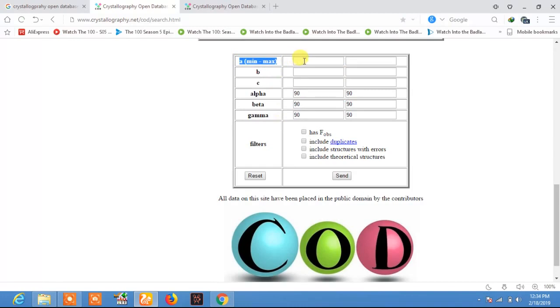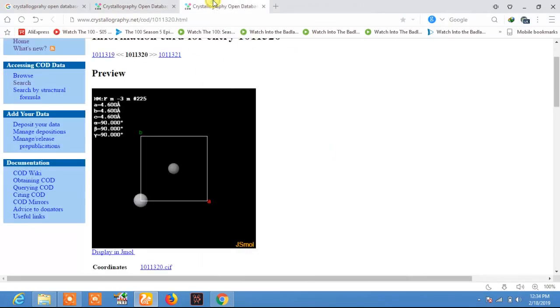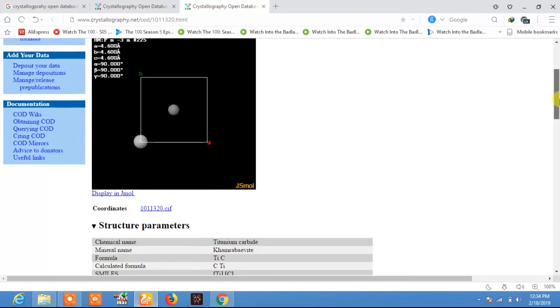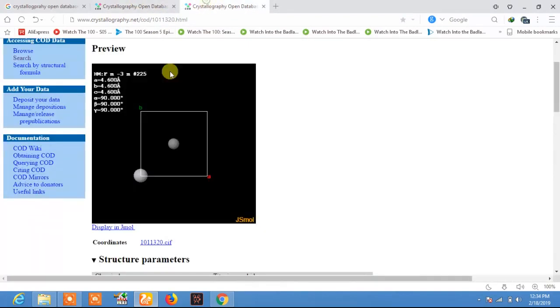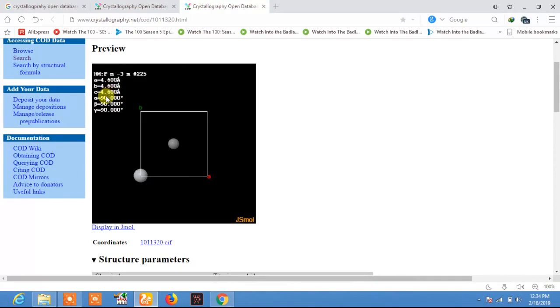I will get the lattice parameters from the file we already found. For TiC, A is equal to 4.600 Ångströms. This is a cubic crystal structure, so B and C are equal to A, and all the angles — alpha, beta, and gamma — are equal to 90 degrees.